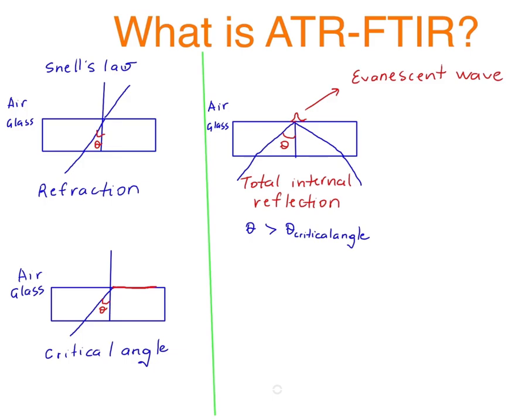Typically samples are immobilized or put right here on that glass, on the material. If we have a sample here, maybe benzene, or some kind of organic.